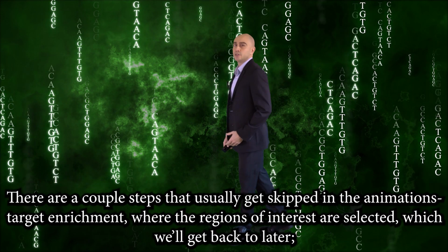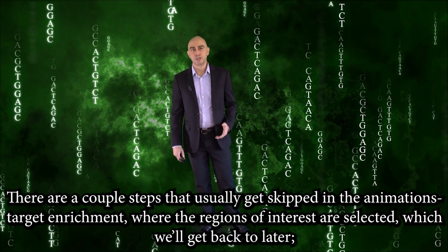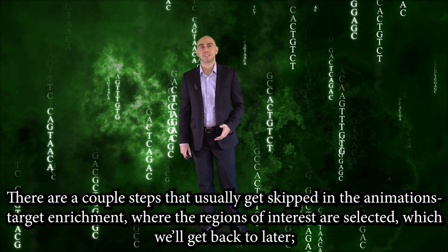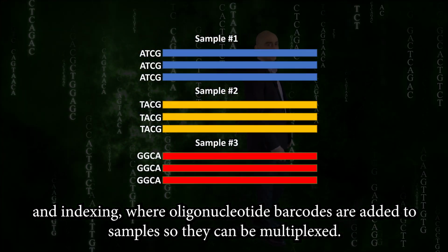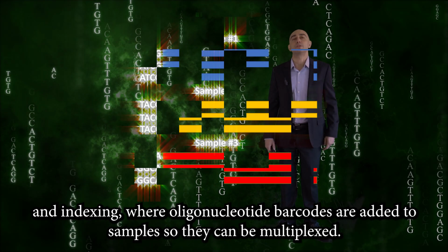There are a couple steps that usually get skipped in the animations. Target enrichment, where the regions of interest are selected, which we'll get back to later, and indexing, where oligonucleotide barcodes are added to the samples so they can be multiplexed.